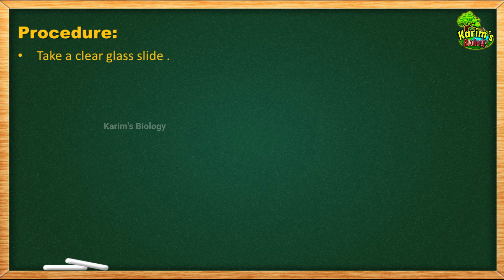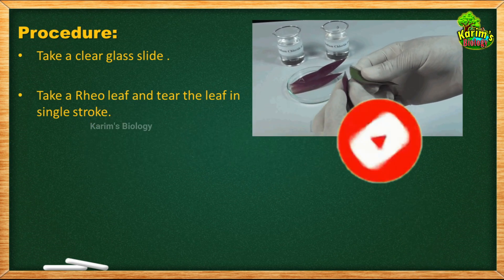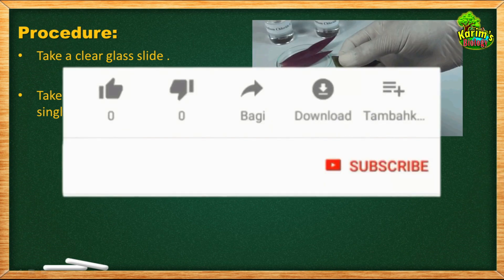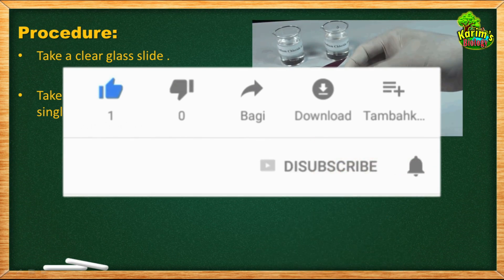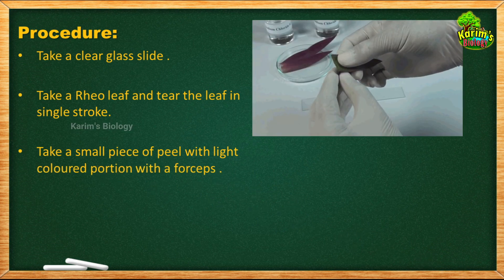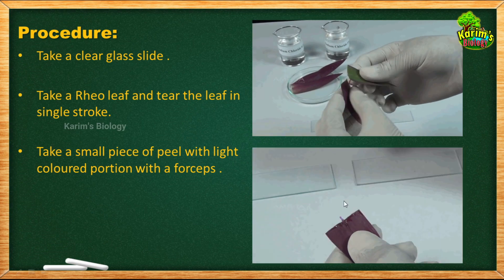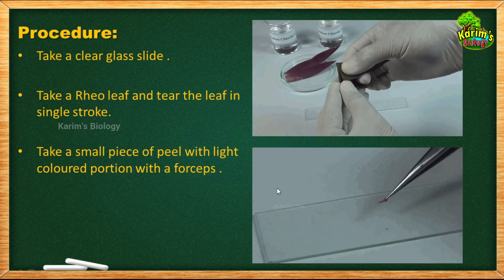For the procedure: first, take a clean glass slide with no spots or damage. Second, take a Rhoeo discolor leaf and separate a single layer of the lower epidermis. To do this, simply break the leaf at the middle and pull the lower part — you will get a thin layer. Take a small piece of peel with a light-colored portion using forceps and carefully place it flat on a slide, making sure there are no folds.